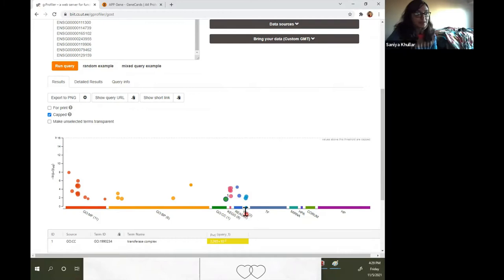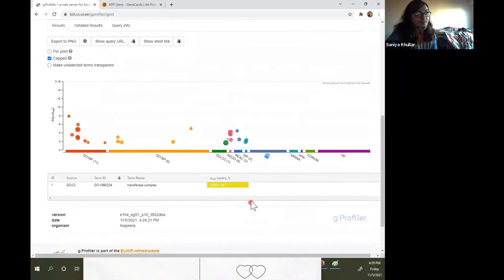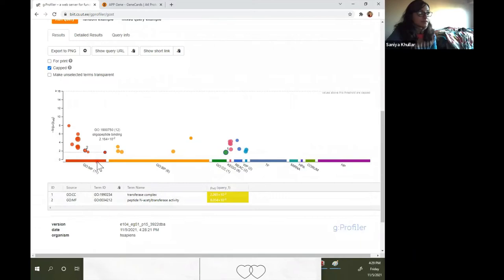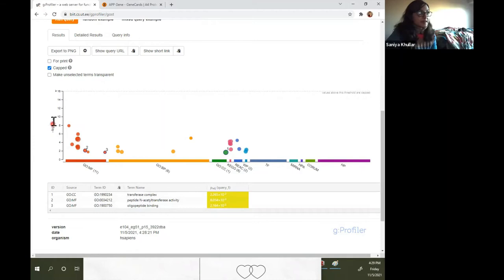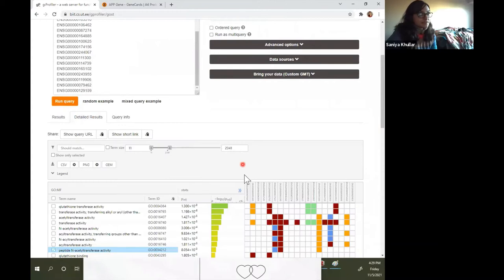We also have KEGG, Reactome, and WikiPathways, as well as TF. When you select them, you can see results. You can click on these and they'll show you what is there. These are the negative log and key adjusted values, and this is telling you from this random result, how many of the results are from each of these databases.